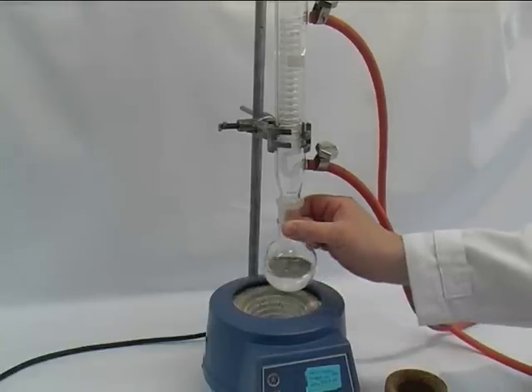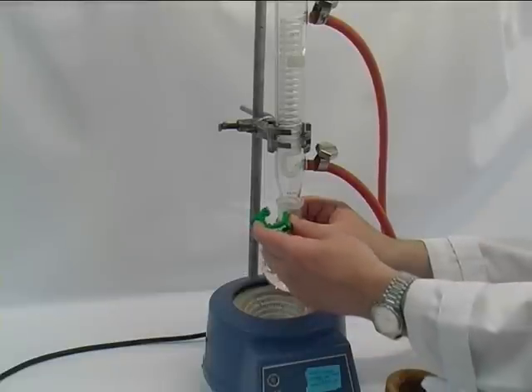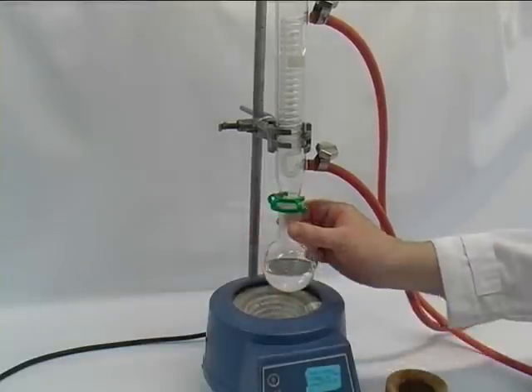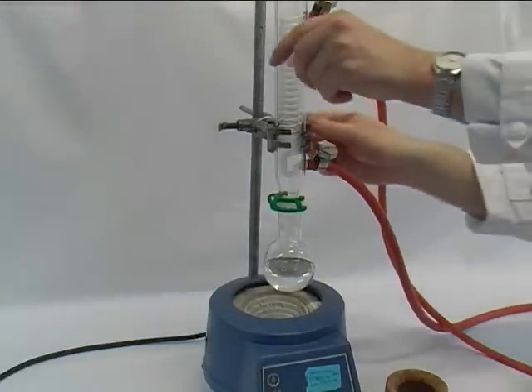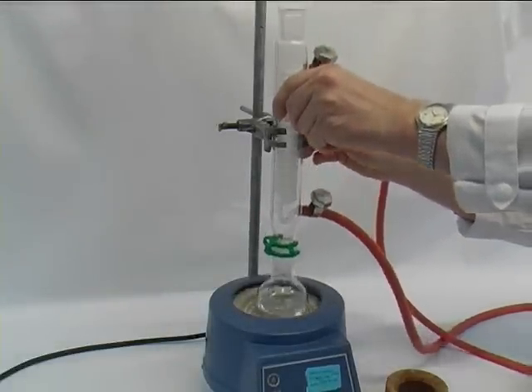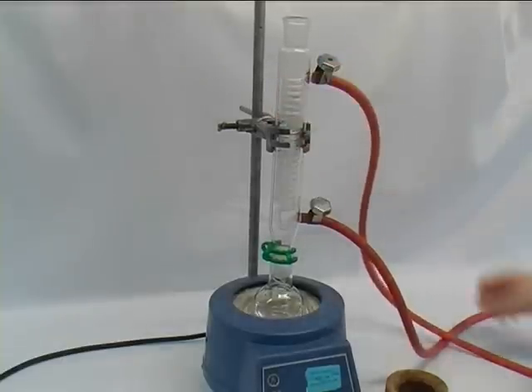Then we just clip the round bottom flask onto the reflux condenser and lower it into the heating mantle. This is very easily achieved if the whole setup is vertically aligned.